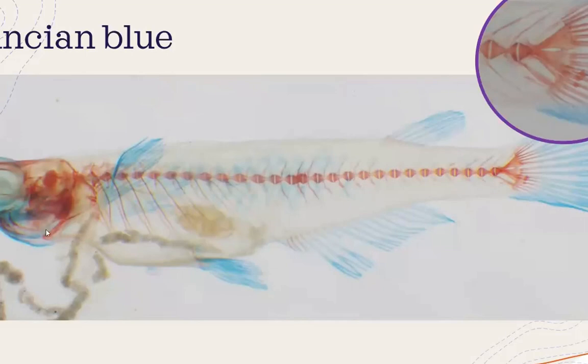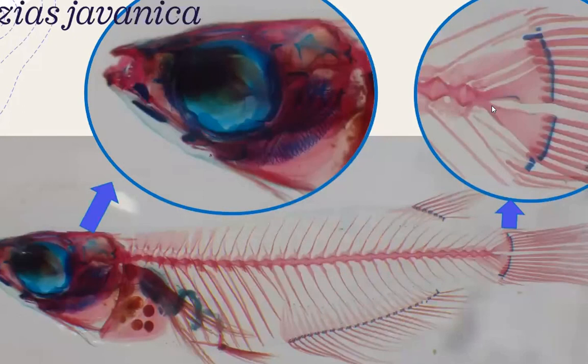All the fins are cartilage bone, and some part of them here, the eyes is circular, and also some part of cartilage bone here until some part of the last one, the branchial. And some species on the fins are the normal one. It becomes red, Alizarin red, staining clearly, not only for the joint here. You see the joint here.